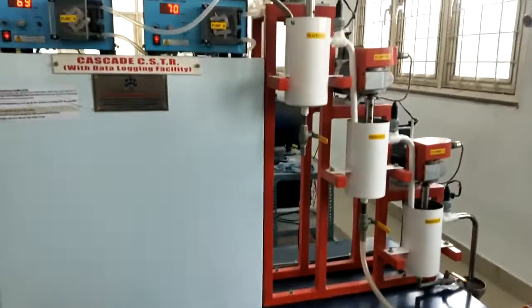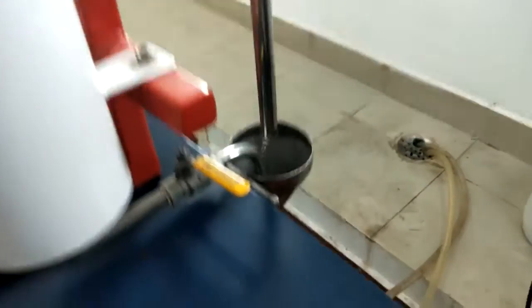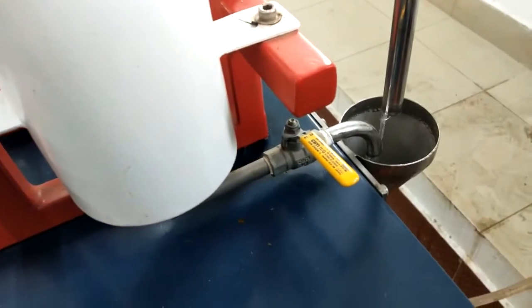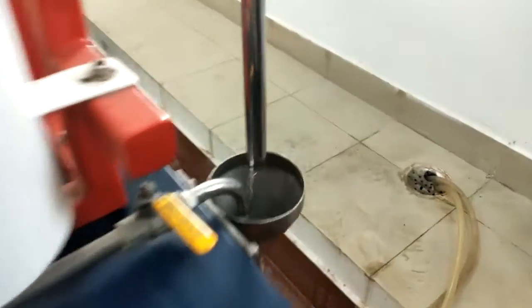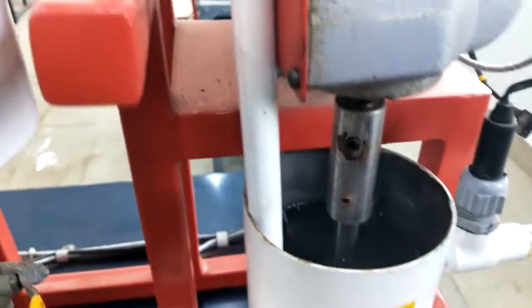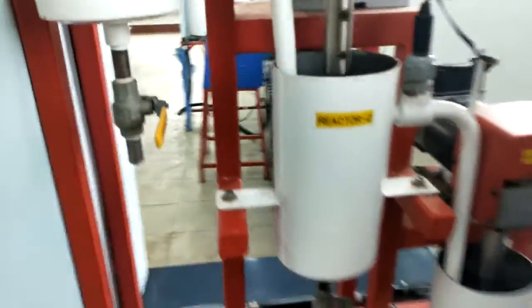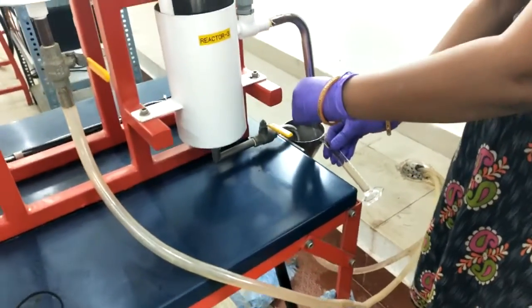So we waited for some time. You can see we have the continuous outlet. We waited for some time. You can see the level of liquid in all the 3 tanks is up to the outlet pipeline level. Now we will collect 10 ml of sample corresponding to 70 rpm.